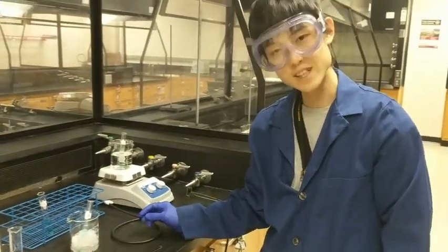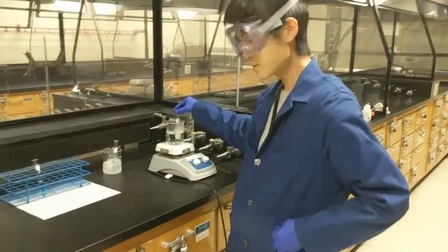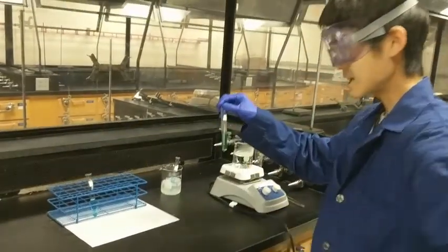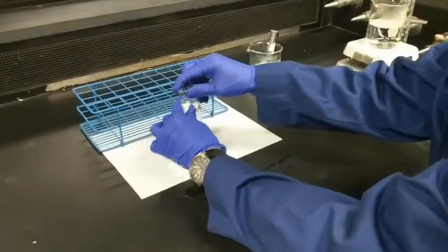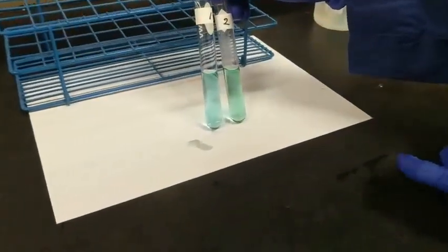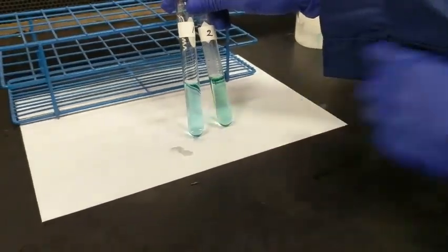for about 10 minutes. Now I'm going to take the second test tube from the hot water bath, and let's see the color. I recommend doing it on a white background because it's sometimes hard to see the change of color, but the second tube should be more green than the reference. Okay.